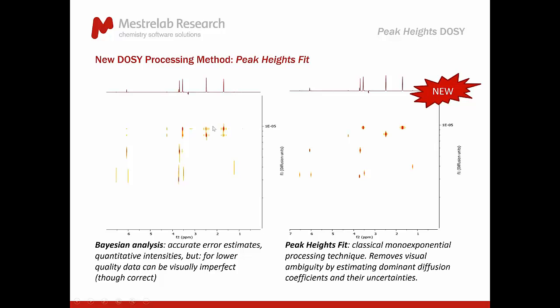That's a consequence of the correct error estimate in these cases. Other software packages use a slightly different approach, which is a bit more filtered, so you can see only the dominant contributions to the DOSY, and many people use it.